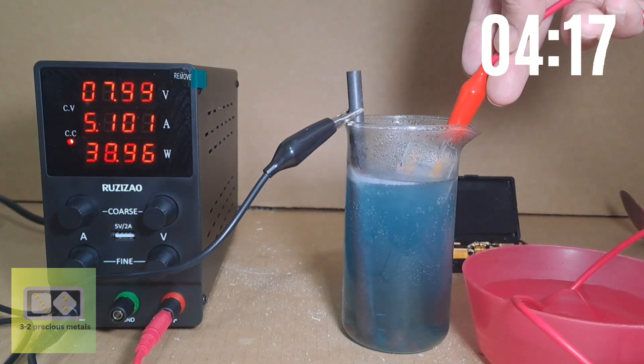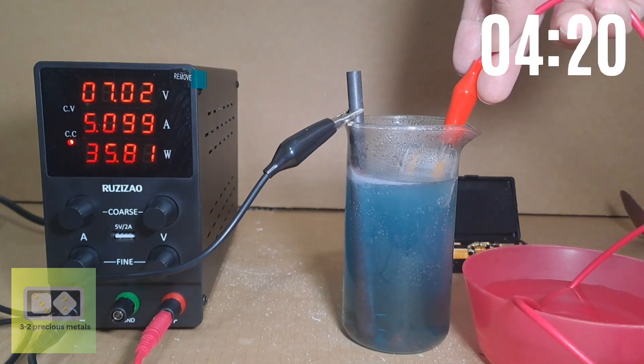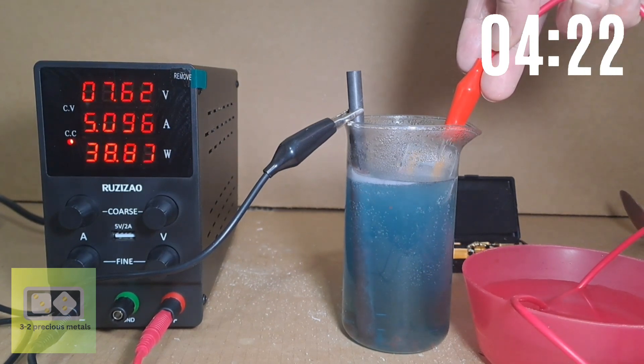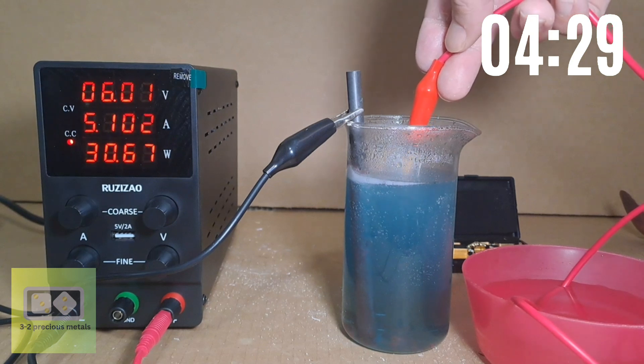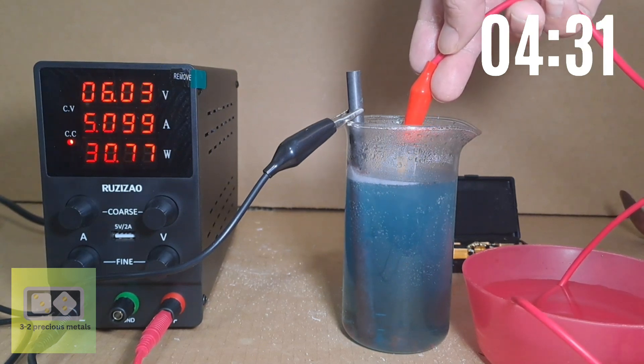Also, the electrolyte solution has turned a deep blue color. A blue-colored solution usually means that there is copper in solution. If you look closely at the cathode, you will notice there is a large amount of copper being deposited there.